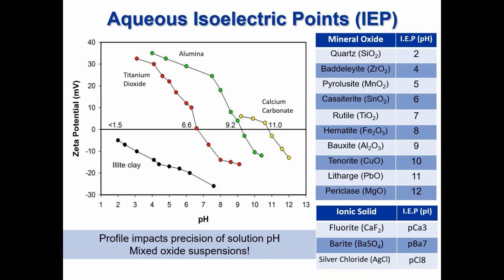We can see from the table that at all pH values between pH 4 and 11, a mixed slurry will be unstable and the various materials will be massively heterocoagulated. The degree of aggregation and the structure created will be different depending on the specific pH between 4 and 11.